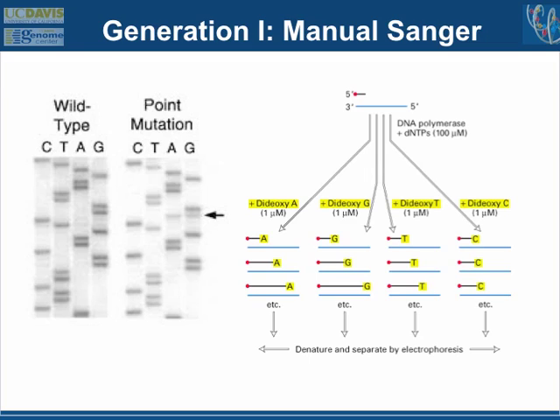And then the way the sequencing works is you have 4 different tubes. In each tube, you add a terminator that terminates a small fraction of the sequencing reactions whenever an A is put in, in tube number 1, and a small fraction of the sequencing reactions when a C is put in, in tube number 2, and in tube number 3 for G, and tube number 4 for whichever one I didn't say already, T maybe.